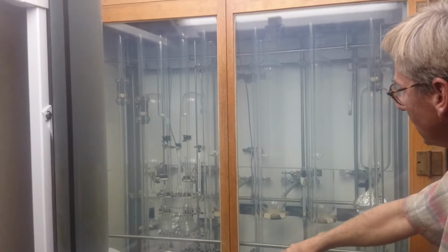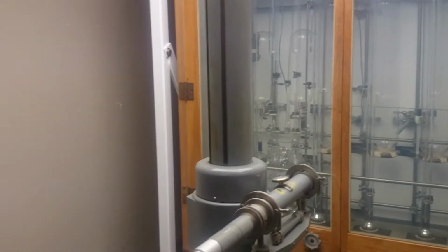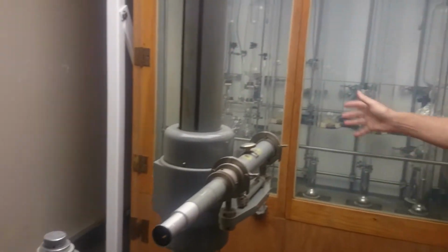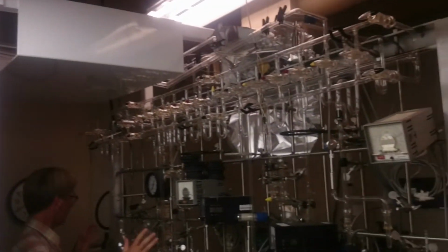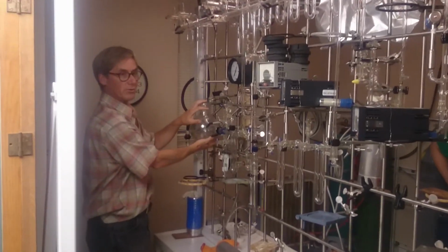A chamber that's connected to this mercury reservoir. We measure how high the mercury column was here, and then you can measure the pressure there. This would push down the mercury and cause this to pop. So you can measure the pressure with the mercury column height. Then you pump the air away. And he pumped the air away with pumps over here, and as the air is being pumped away, he freezes out the CO2 with liquid nitrogen. This is a trap you use for that.